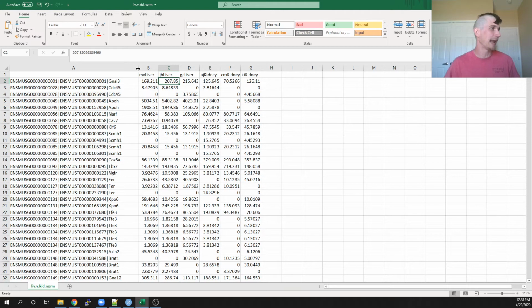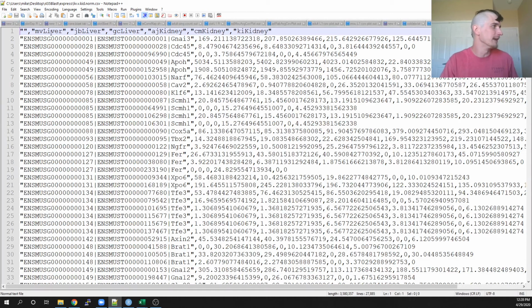But again, I just want to hang on to these numbers. I may use these numbers again, right? Once I have these numbers in a table format, I can draw this stuff out. But I do just want you to recognize that this is comma separated. All that means is that all of these columns are separated by a comma. And Excel can inherently read this. Any kind of CSV file or tab file, Excel can inherently read and kind of make life easier for us. But this is what a CSV file actually looks like: every single column is separated by a comma.